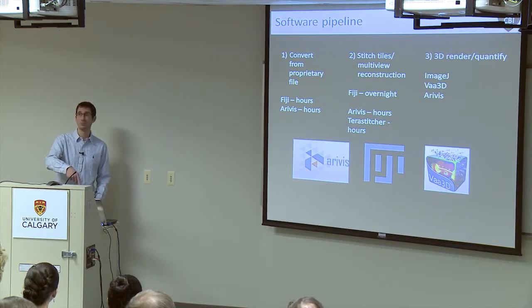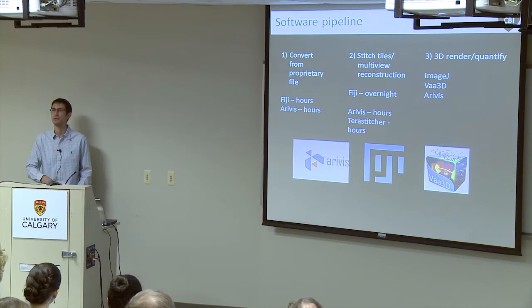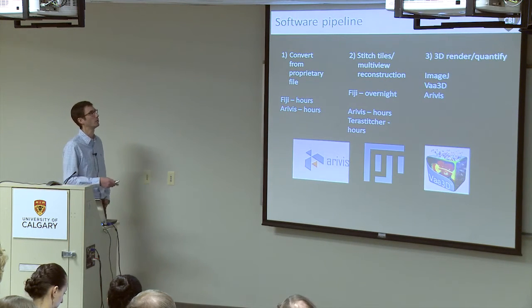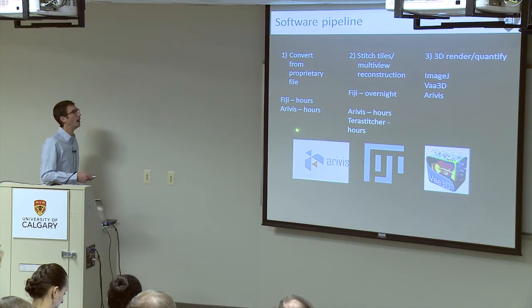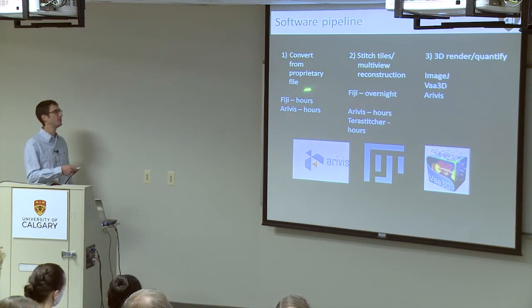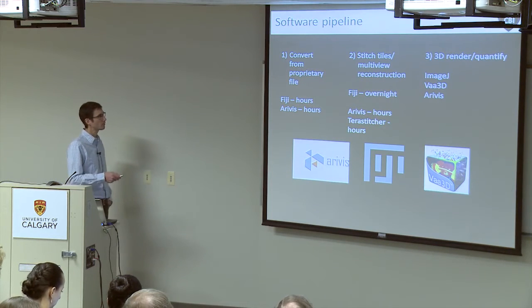I could actually run it on my laptop here with a 10 terabyte data set. I could 3D render it and show it to you. It doesn't require a lot of computing power. It's really a pretty phenomenal piece of computer science. So it can also do this conversion, okay? And it's going to take basically the same amount of time as Fiji.